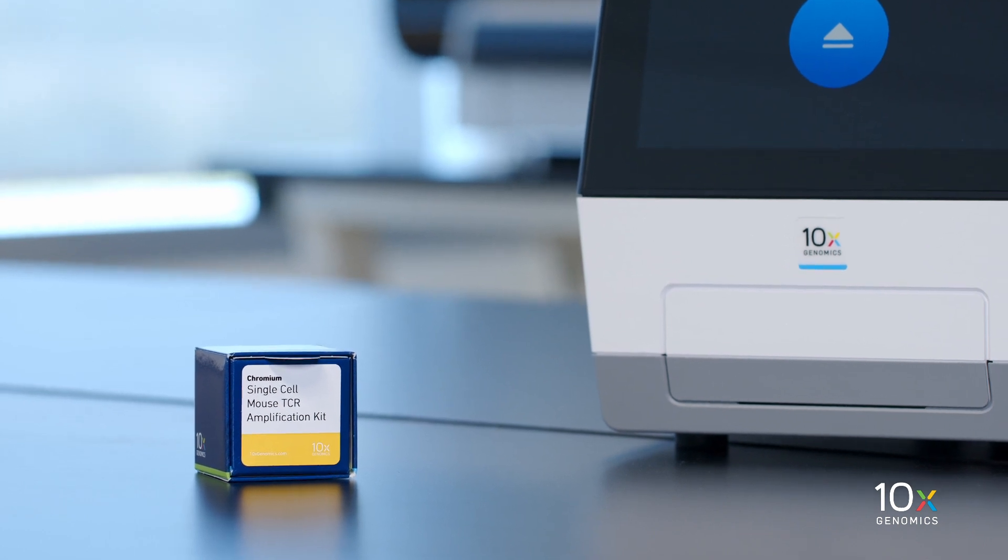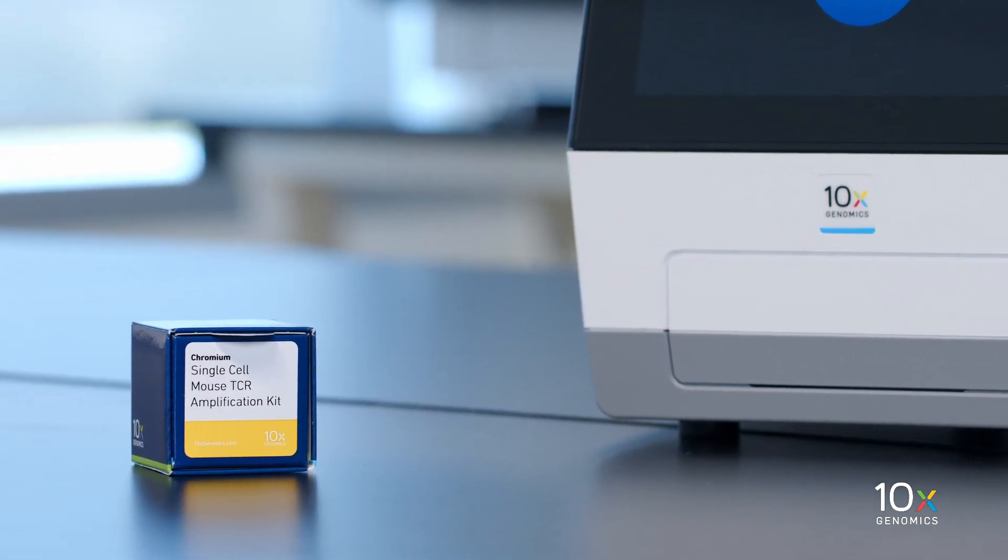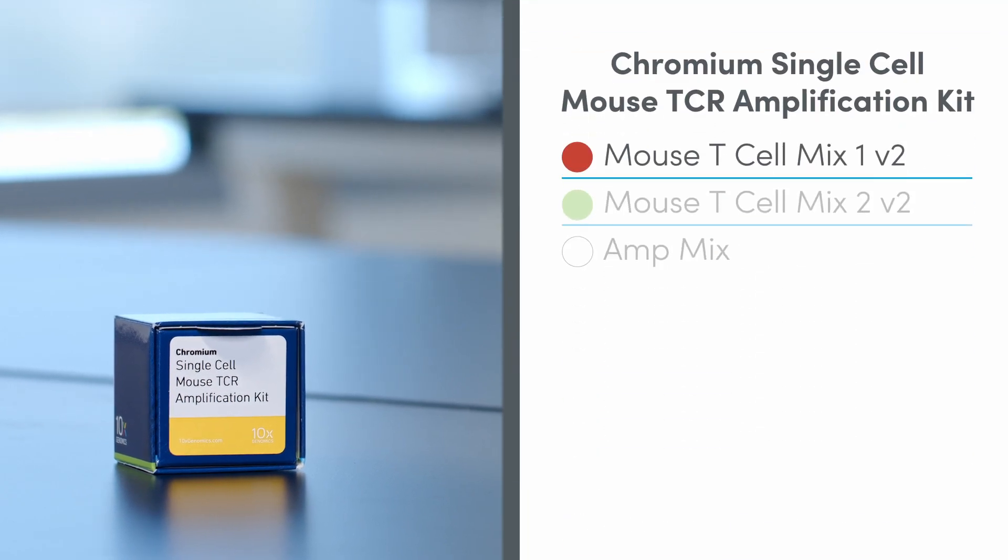The Chromium Single Cell Mouse TCR Amplification Kit is stored at minus 20 degrees Celsius and contains Mouse T-Cell Mix 1 V2, Mouse T-Cell Mix 2 V2, and AmpMix.